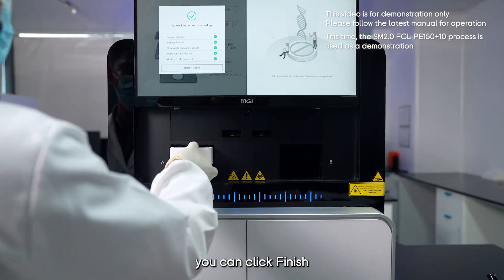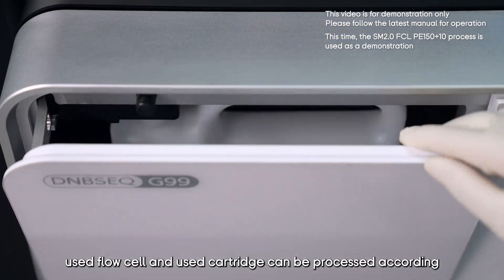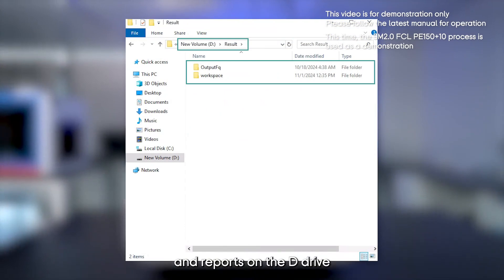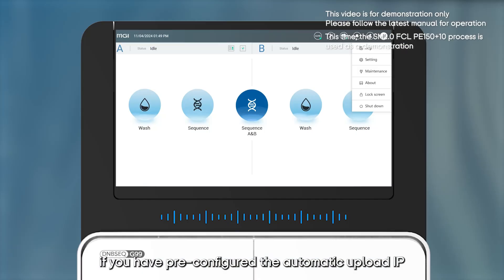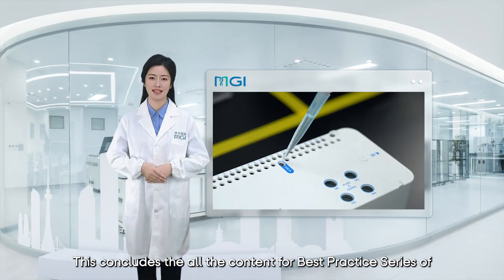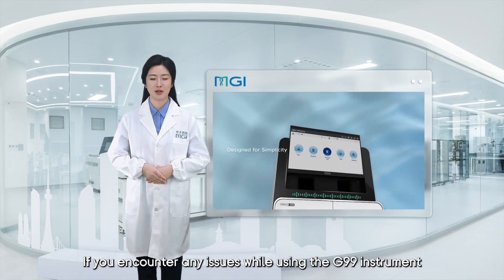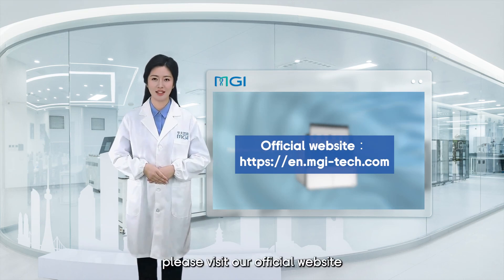Since Auto Wash was selected during setup, the instrument will perform an automatic wash after sequencing is complete. Once all procedures are finished, the software will automatically display the sequencing report on the UI interface. Click Finish — the screen will rise and the waste liquid compartment door will open automatically. The waste liquid, used flow cell, and used cartridge can be processed according to laboratory requirements and local regulations. The sequencing software will automatically save the generated data and reports on the D drive. You can export data via USB drive or external hard drive, or if pre-configured, data will be uploaded to a cluster. This concludes the Best Practice Series for DNBseq G99 FCL PE150. If you encounter any issues, please contact our field application scientist or visit our official website.